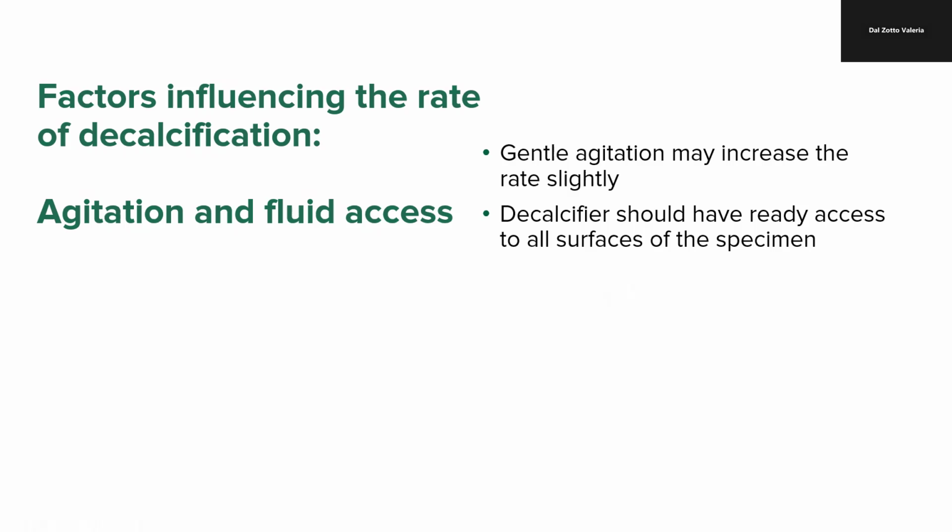All of these methods will have a deleterious or undesirable effect. If you increase the temperature, you are going to be able to accelerate the rate of decalcification, but also accelerate the rate at which the tissue macerates. So make sure that you do it with someone else that has enough experience on this at the beginning.